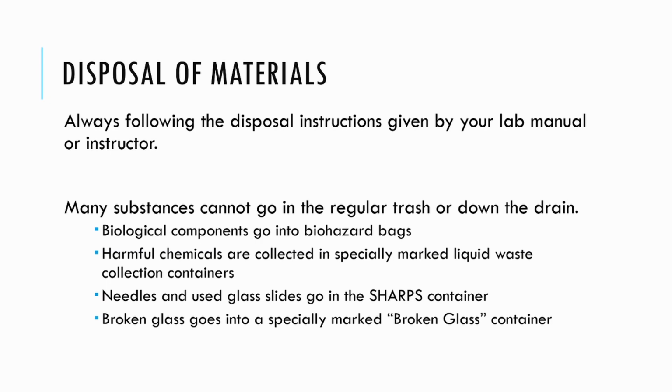Broken glass has its own specific container, usually a cardboard container marked broken glass. Do not ever put broken glass in the regular trash can. You run the risk of injuring those who help keep your lab nice and neat and tidy if you do.